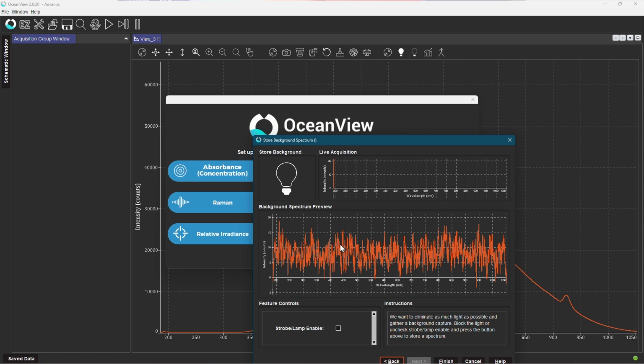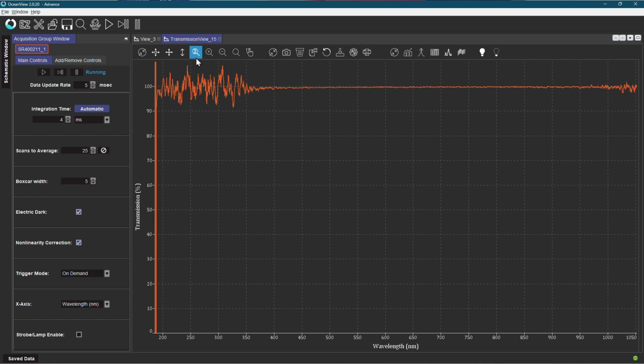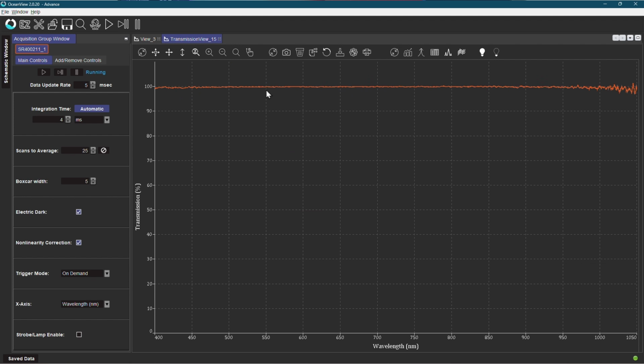In absorbance, when we looked at our reference, we were at 0, right? Because no light was being absorbed. Now with transmission, we're at 100%. So our values are different. And again, they're inverse of one another. So once we're in the mode, then what we can do, and I'm looking at the bounce here, I would probably do more averages if I was making measurements for a customer.